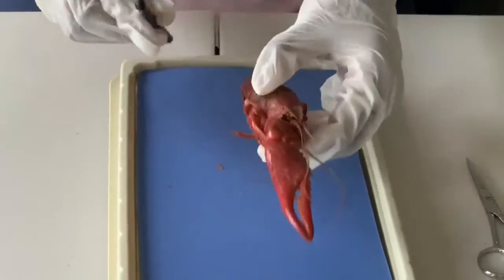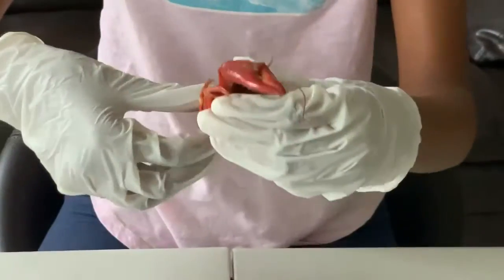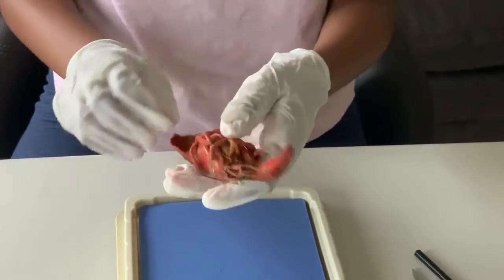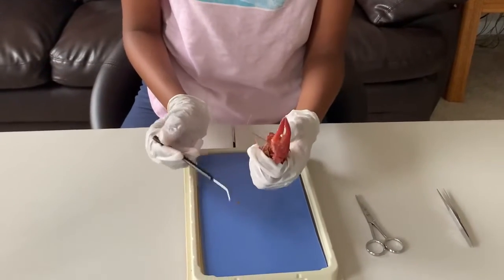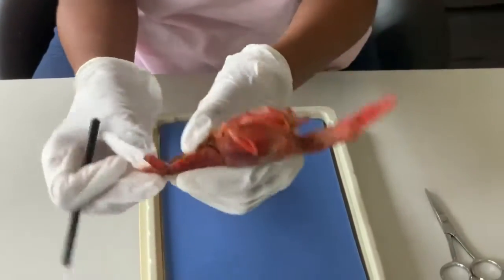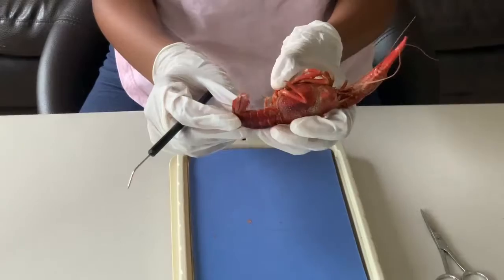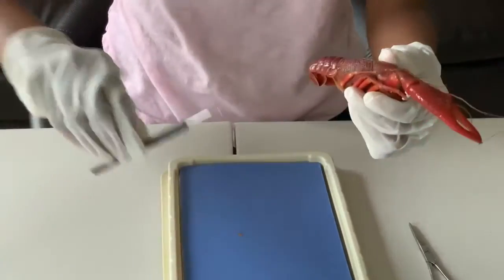Did you know that crayfish walk forward but they always swim backwards? They use their tail to propel themselves backwards. A crayfish has a complete digestive tract — it has a mouth and an anus. A small hole at the end of the tail is the anus. The tail is in the shape of a fan, and this helps propel the crayfish backwards in the water.